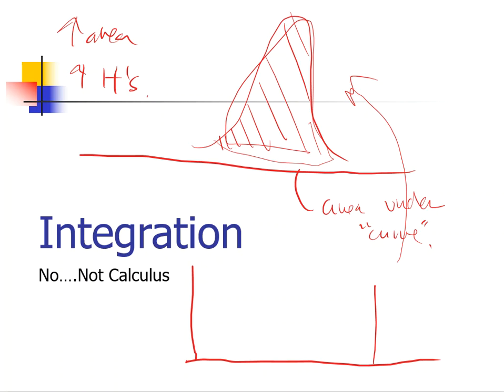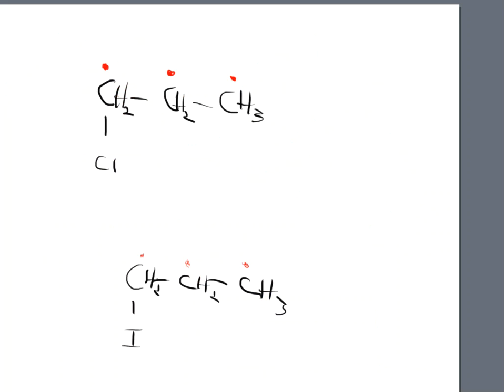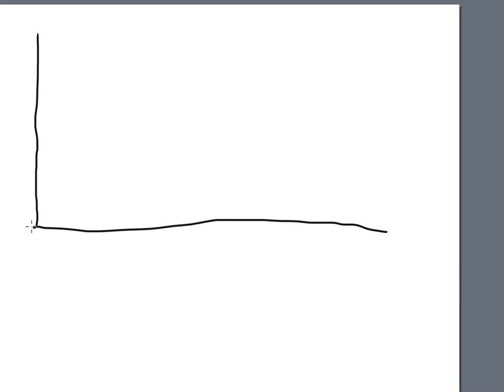All right. So typically in an NMR, we have a computer system that does quite a bit of this for us. We are not required to go in and integrate these by hand, for goodness sakes, right? So we're not going to go that far into calculus. But if we do see a signal that begins to show up, there could be a number that's associated with it. And that number is going to be in regards to an area, a possible area from that particular signal.